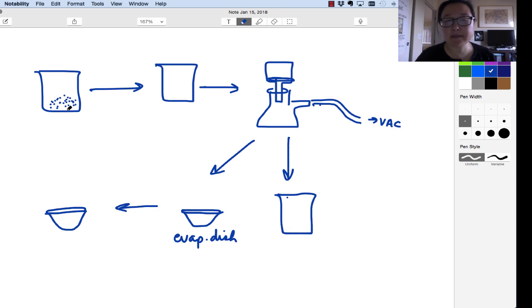The first step is you take a beaker and take some of your mixture and weigh it out precisely and write that down. I'm just going to write some notes here to help you visualize what's going on. We're going to have three compounds in here: silicon dioxide, which is the main component of sand and glass, sodium chloride, which is table salt, and calcium carbonate, which is what limestone is made out of. They're mixed together, and it's called a ternary mixture because there's three of them. And our goal is to separate out each one.